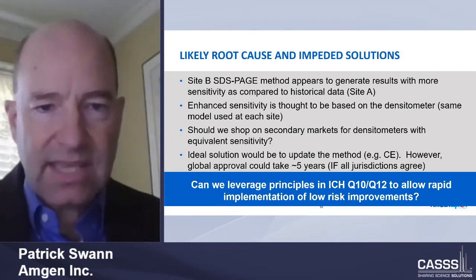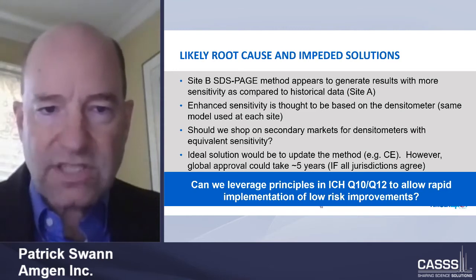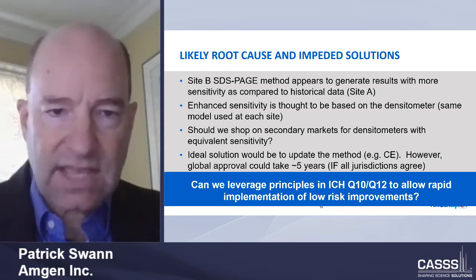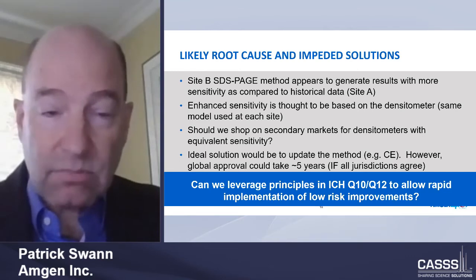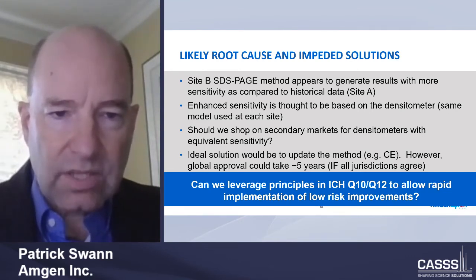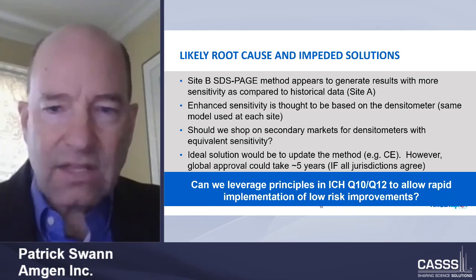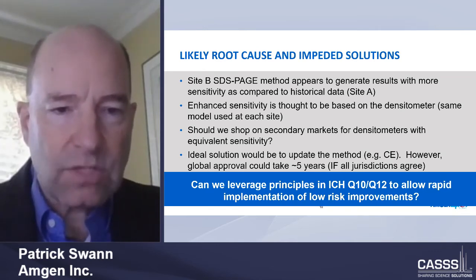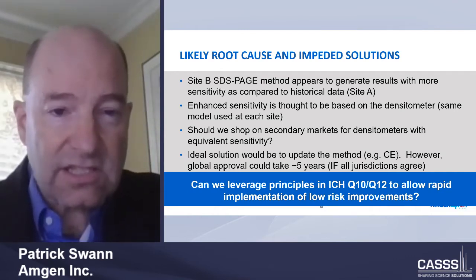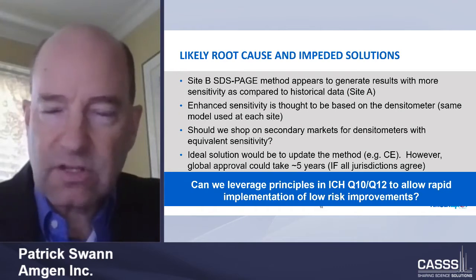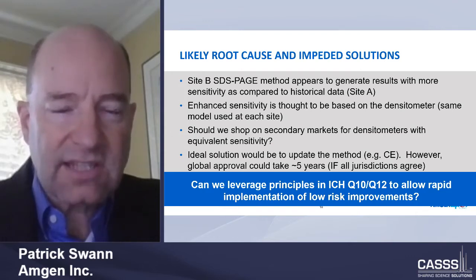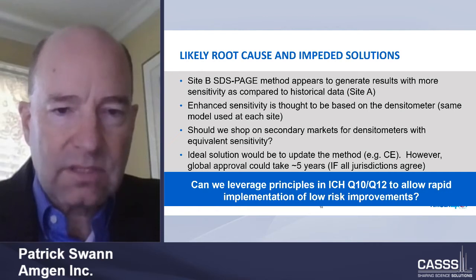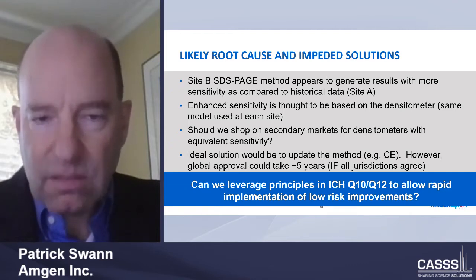The likely root cause is that site B's SDS-PAGE method appears to generate results with more sensitivity compared to historical data at site A. This enhanced sensitivity is thought to be based on the densitometer — the same model was used at each site, but given the nature of this specification, we have this particular challenge. There's no impact on quality, but it's related to the method and what's reported. One solution discussed seriously was whether we need to shop on secondary markets for densitometers with equivalent sensitivity. No one is gaining by all of this effort, since it doesn't impact product quality, but it is a significant effort to address the perceived issue relating to stability as measured by the method at site B.